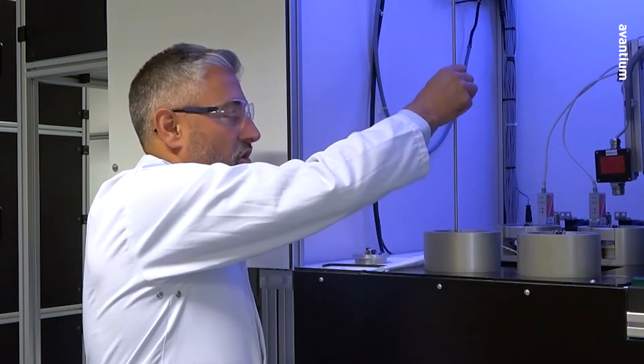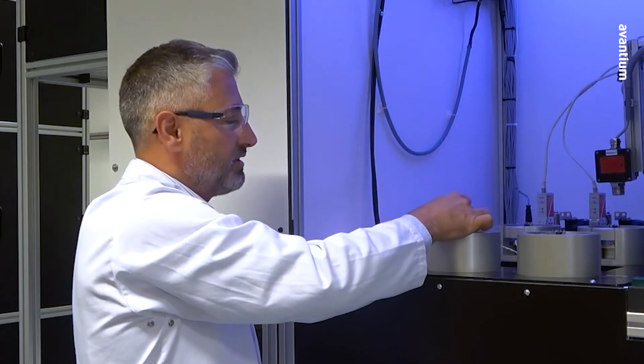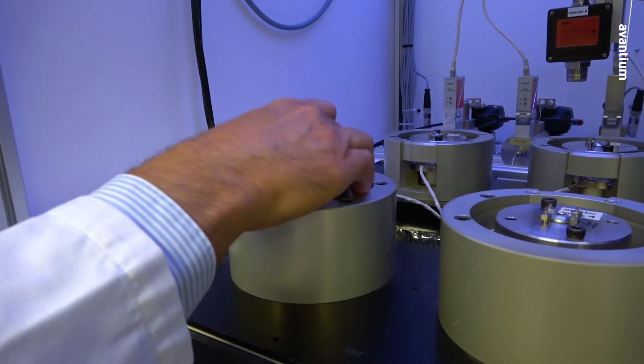the reactor goes in as normal in our Flores technology. The reactor just slides into the block and then we close the block.